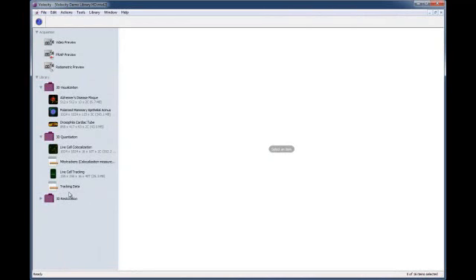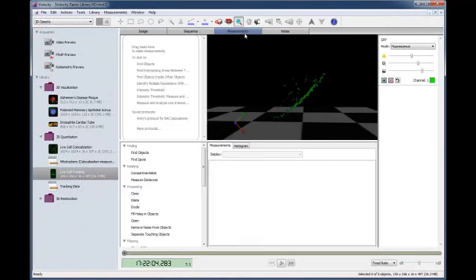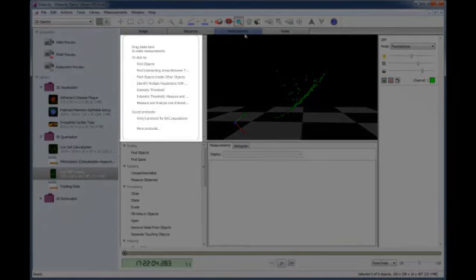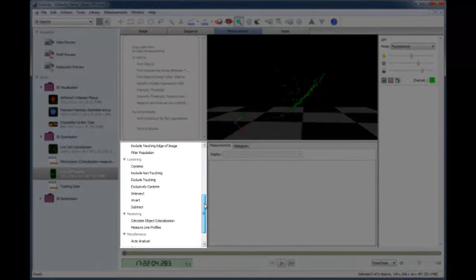Click once on the data in the library list and click on the Measurements tab. Here we see the image view with a table area below it, ready to display measurements. On the left of the screen is the area where we will build a measurement protocol to find objects of interest and track them. Below that is the list of tasks from which we will build the protocol.